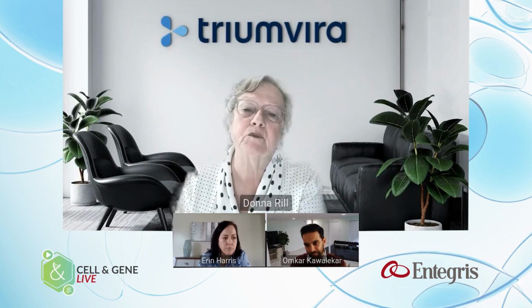From my perspective, and the intent of having a very consistent product at the end, there are a couple of things in consideration. As stressed a while ago, it's important to understand if you're dealing with blood products, i.e. whole blood or leukapheresis, apheresis product, and to understand that composition and what may or may not interfere in your culture process. A lot of that can be managed in different ways. I use the example of red blood cells that are immature. Most culture systems will continue to grow them unless you remove them.